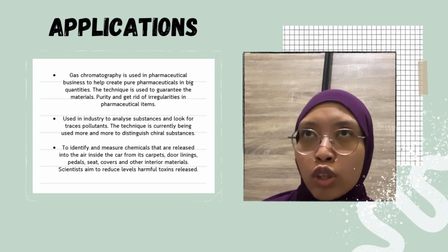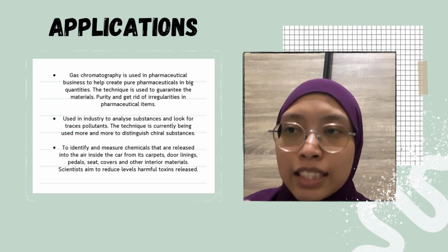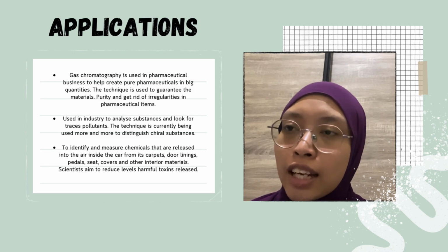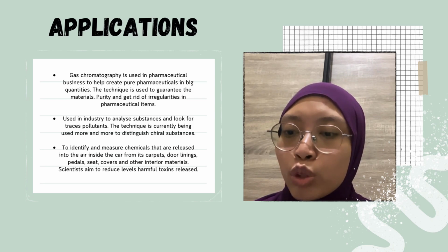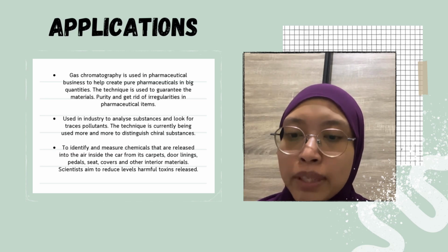It can also be applied in food analysis and quality control, the most common application for gas chromatography due to its component quantification, accuracy and speedy process.